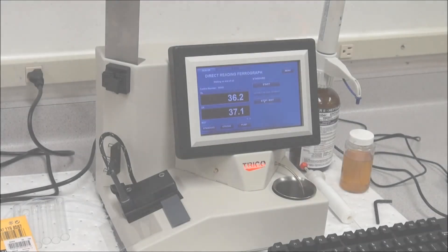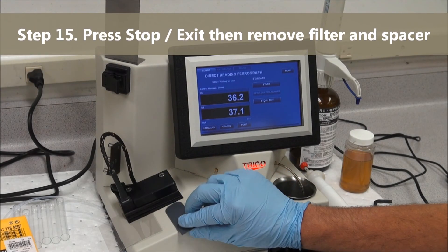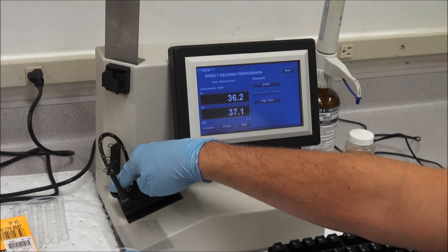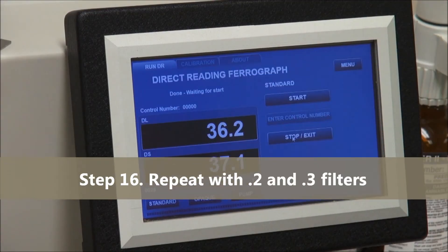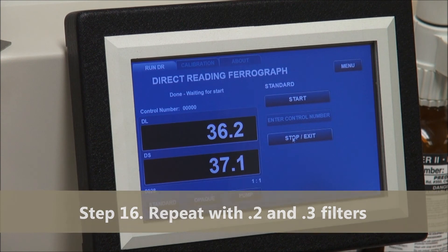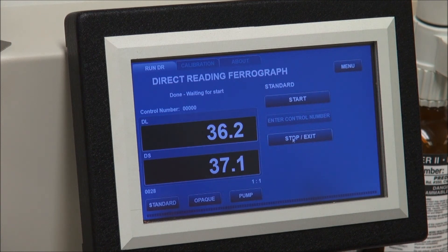Hit stop exit as your test is completed. Remove the spacer, remove the 0.1 filter. Repeat this process with 0.2 and 0.3 density filters. Remember that when inserting and removing density films, failure to remove films during sensor zeroing will cause L&S readings to be 30 points lower than expected.